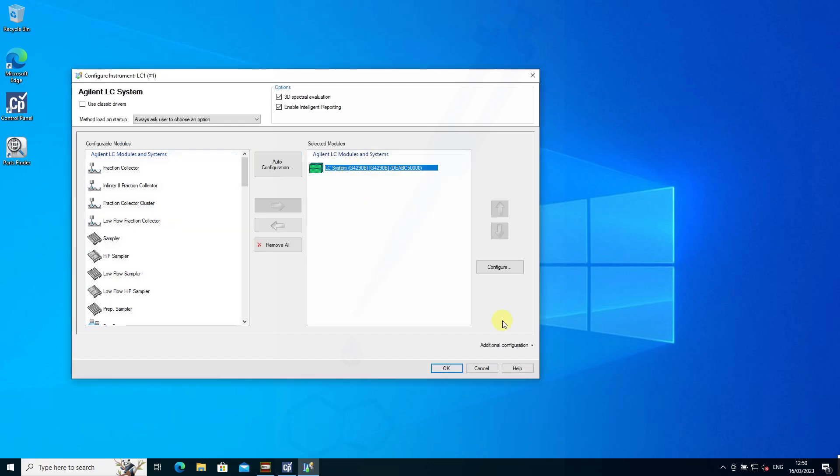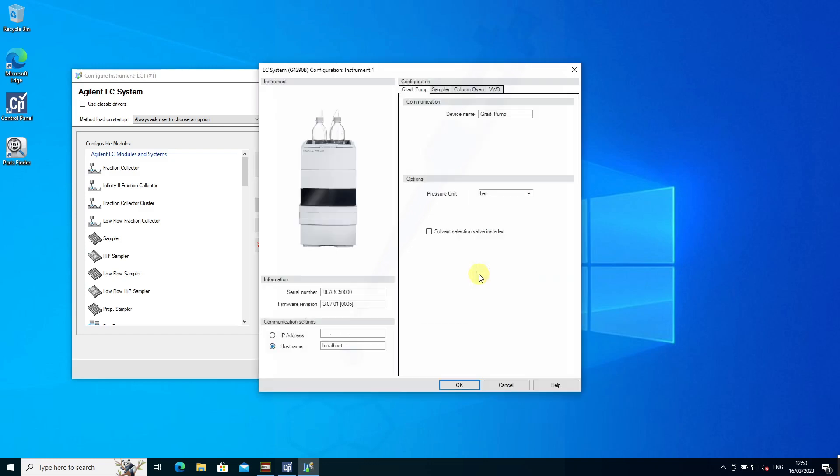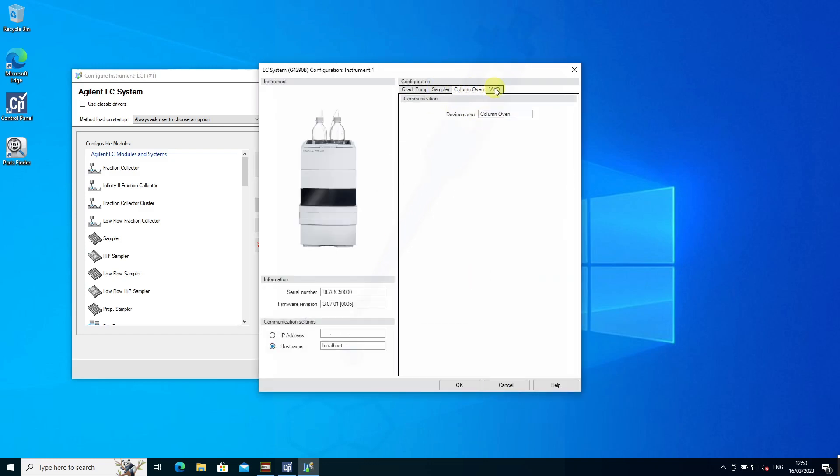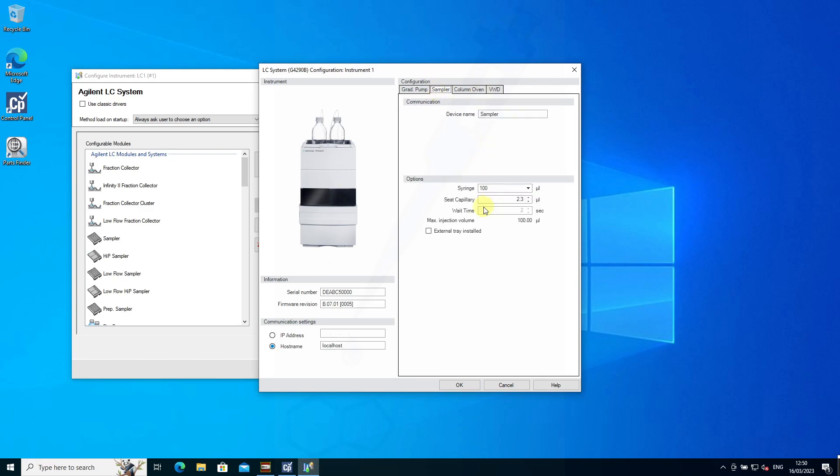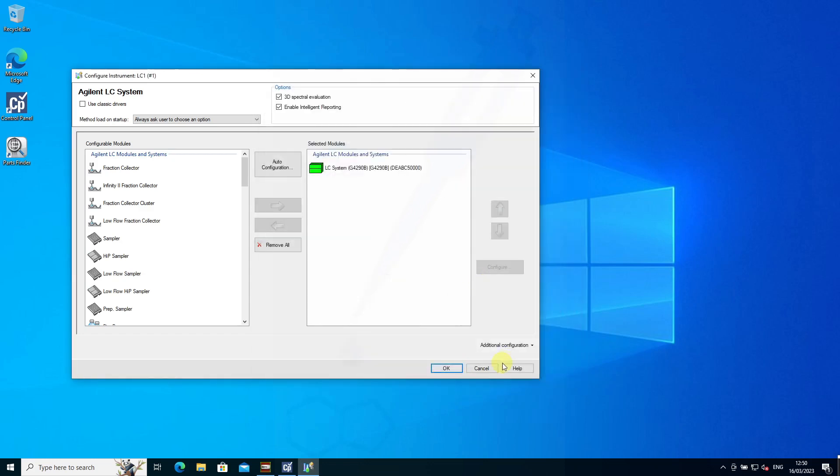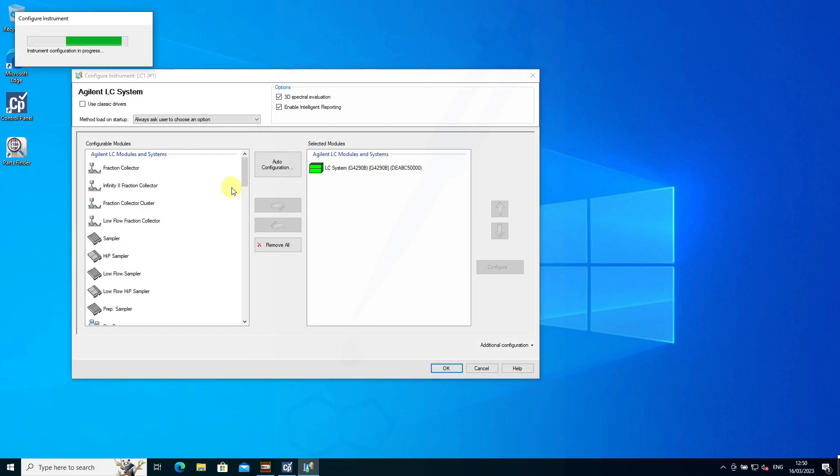In this case, I've got an LC configured, and these are my configurations. It's worthwhile to check your syringe sizes and loop sizes, as well as the analytical head size. Once configured, we can start up ChemStation.